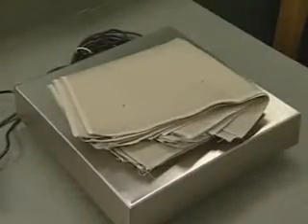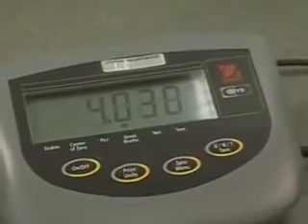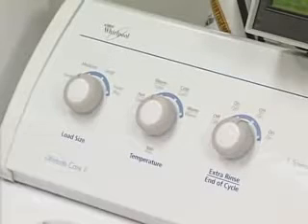The load size should consist of test specimens and enough ballast pieces to make a 4.0-pound dry weight load. Woven and knitted specimens should be washed separately from each other. Exceptions would be in the washing of garments that contain panels of both woven and knitted fabrics. The control should be adjusted to the test specifications.